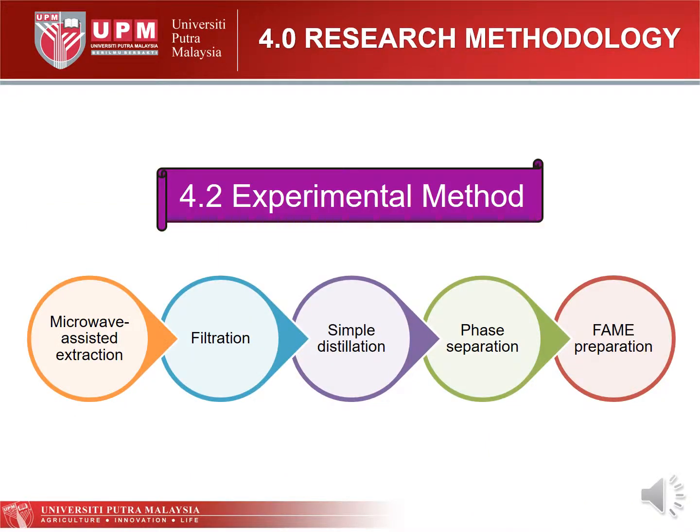For the second part, the experimental method. The experimental method is divided into 5 steps. The first one is microwave-assisted extraction, followed by filtration, simple distillation, phase separation, and the last one is FAME preparation.